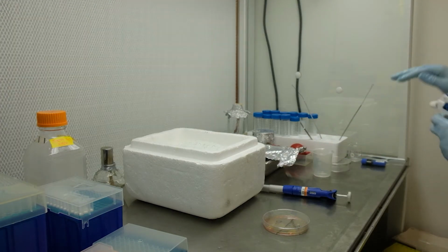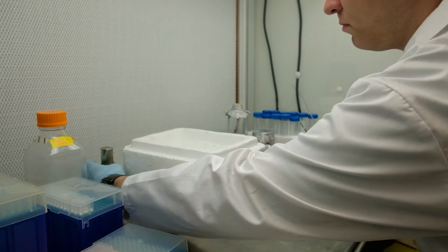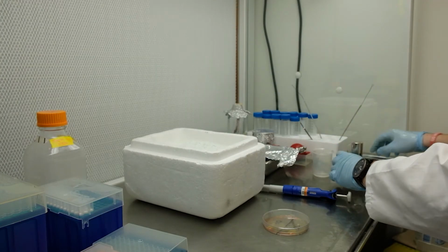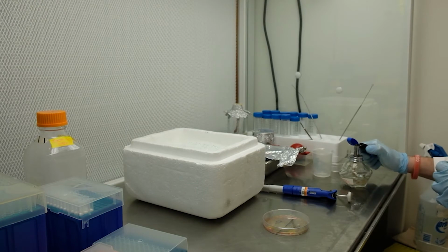Now you need to spread your E. coli. You would usually do it once over the entire dish, but I'm doing it individually for each side A and B. If you're not familiar with this technique, you will soon get to know it from other classes.